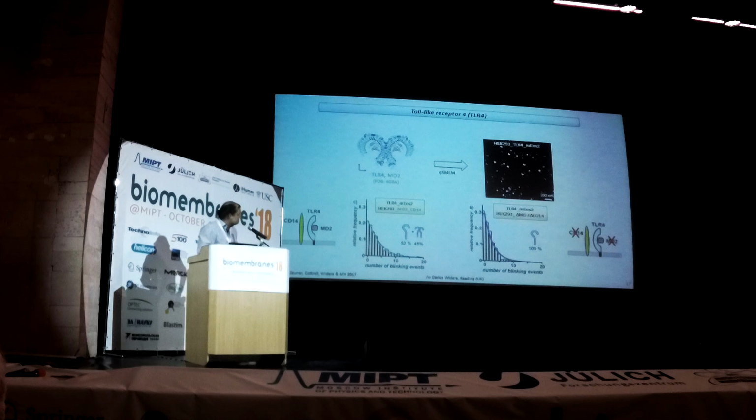And what we find is, for the native case of the resting TLR4, we find again a ratio of about 1-to-1 of monomeric and dimeric receptor. So there seems to be an equilibrium again of those dimers with the monomers. If we remove these co-receptors, we only have monomers. And in that case, biochemistry shows us that this receptor is not signaling anymore. So this was our sanity check.